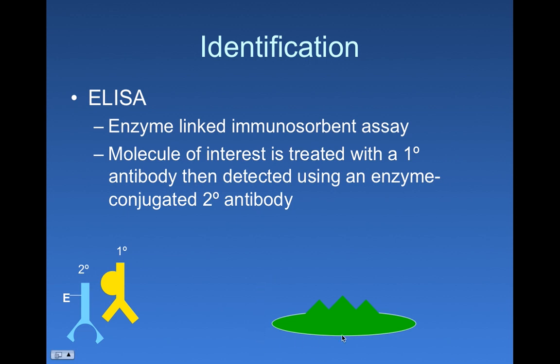Well, let's imagine that this green protein is an Ebola virus protein, and we're interested in detecting this Ebola virus protein because we want to have a clinical assay for whether someone has contracted Ebola or not. Now, this is a viral protein. It's coded for by the viral genome, and so it can be isolated. The gene for it can be isolated. We can make some of that protein in bacteria and purify it using chromatography, and we can have a sample of this purified Ebola protein.